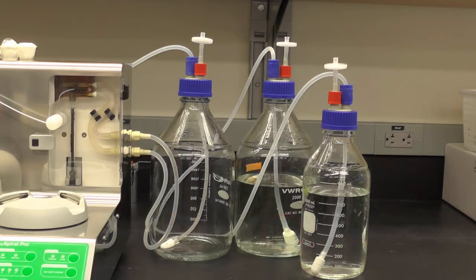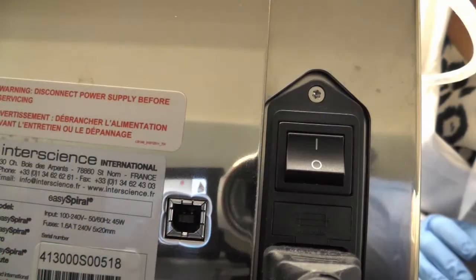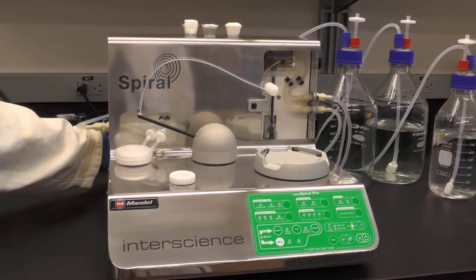Tubes in the disinfectant and sterile DD water bottles should be submerged in the liquid, while the waste bottle should be emptied prior to running your experiment. Turn the power switch located at the back of the instrument to the on position.